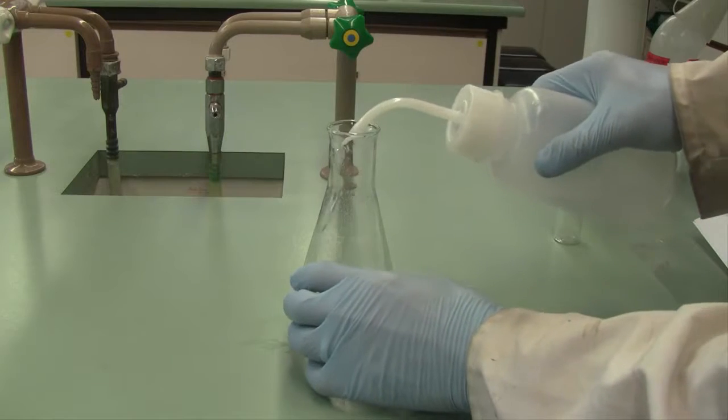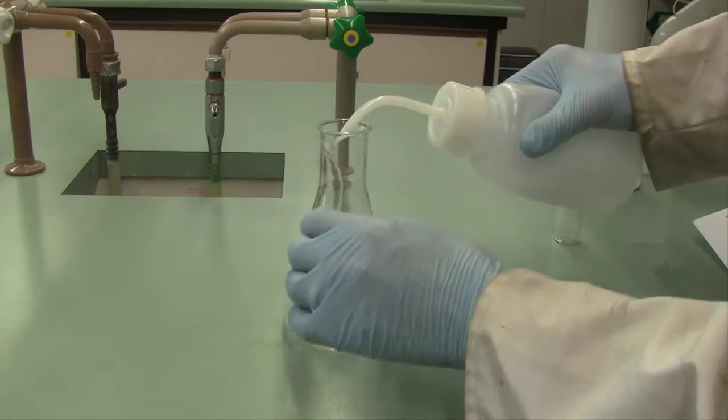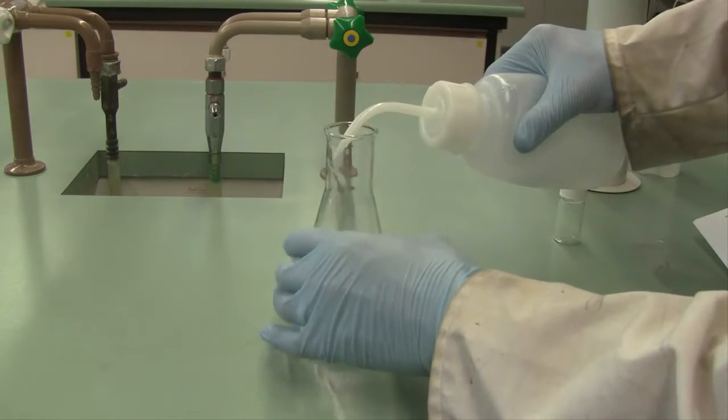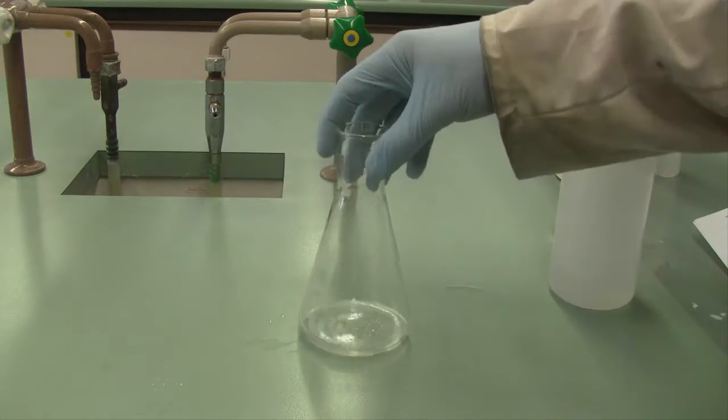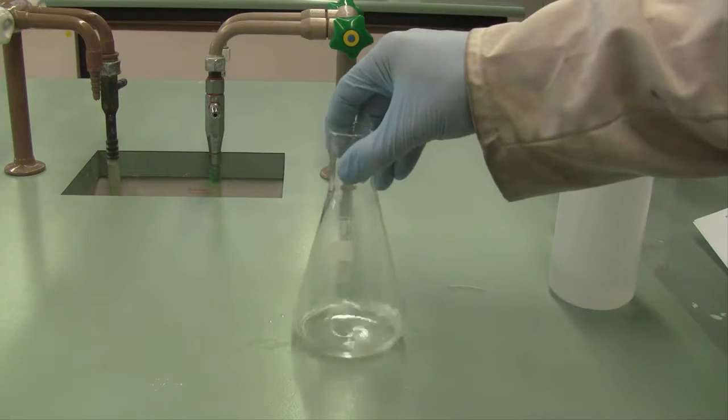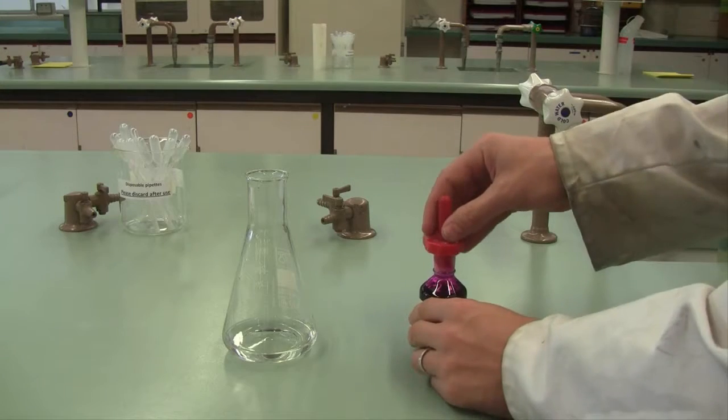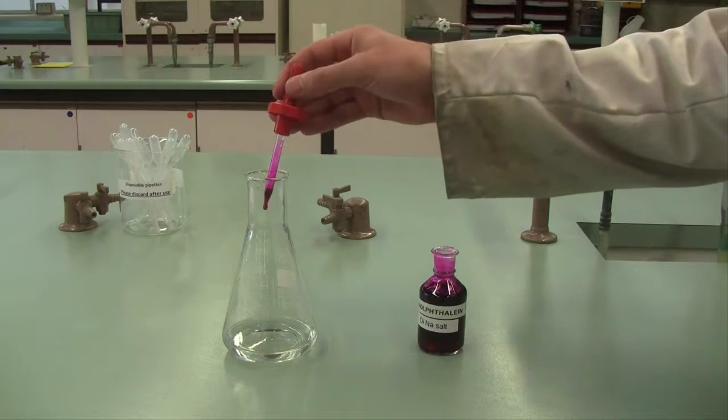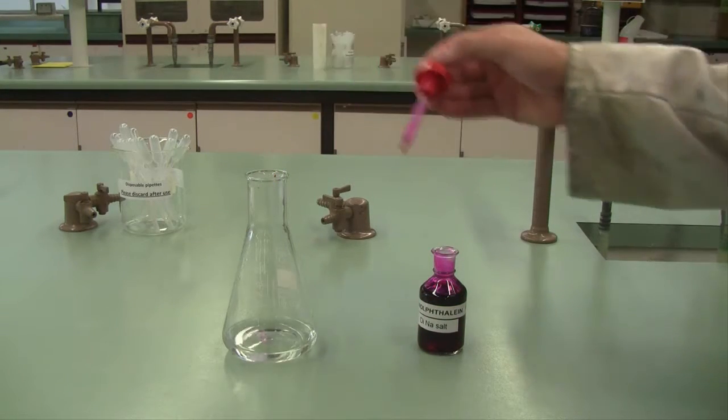Back out in the lab, use your wash bottle to wash down the walls of the titration flask. Make sure all of the solid has been washed into the water, and then mix thoroughly until all of the solid is dissolved and you have a clear colorless solution. Add two or three drops of phenolphthalein indicator to the solution.